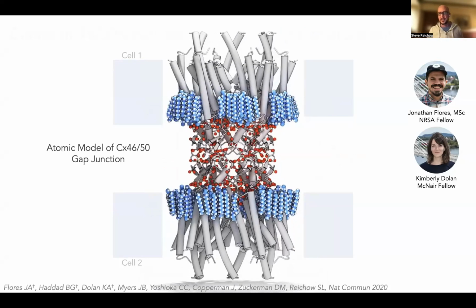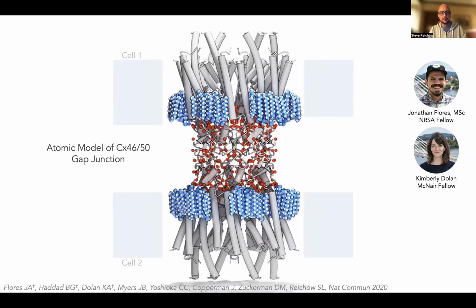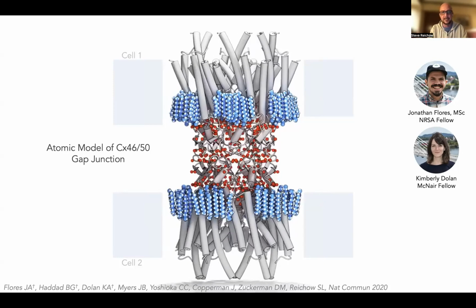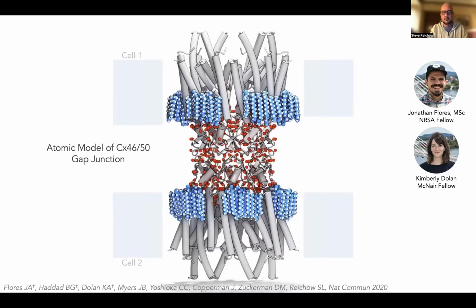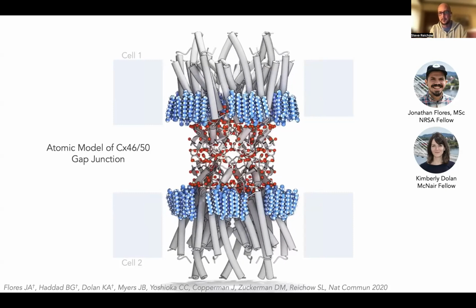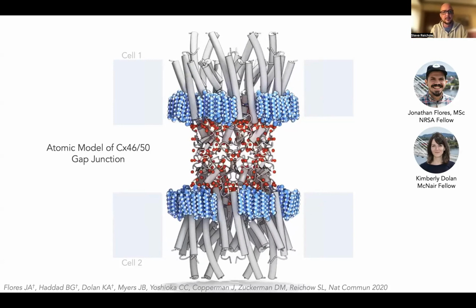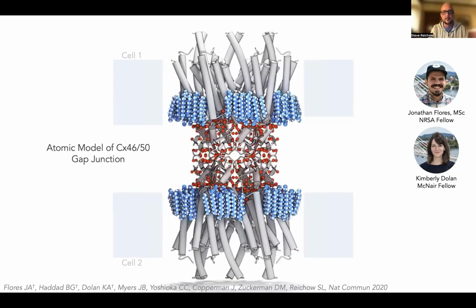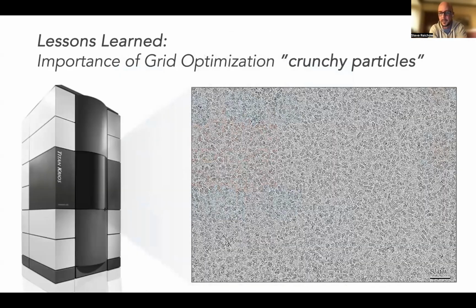And so I know that many of you in this group will have some more experience in electron microscopy. And so I want to take a little bit of an aside and just point out a couple of lessons that we've learned from this project and from collecting many other data sets on this protein since, that I think are informative and hopefully helpful to those of you who are maybe embarking on your own cryo-EM projects on your favorite membrane protein.